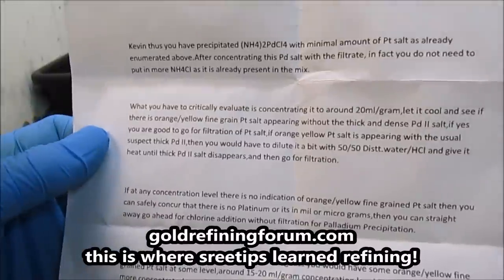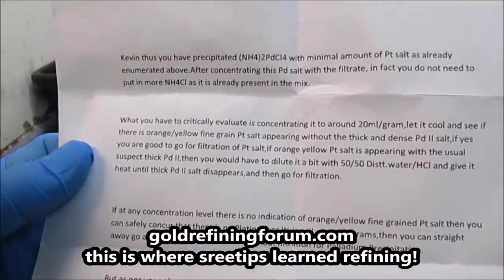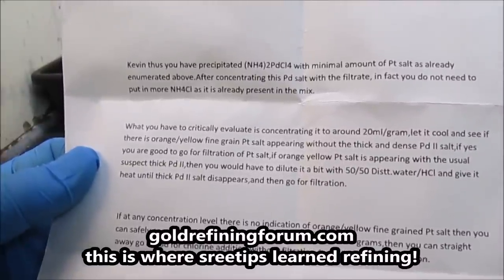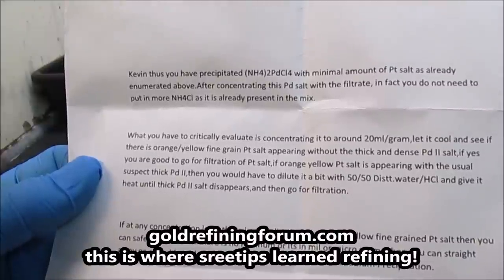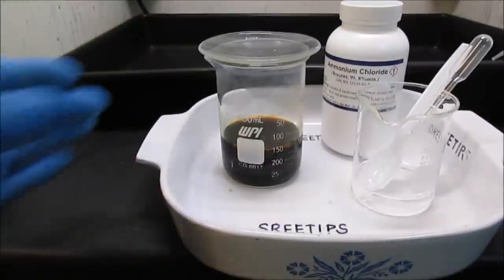Before I show this next segment, I want to go back in time. Three or four years ago I tried this experiment and I over-concentrated the palladium solution to about 5 ml per gram concentration. When I added the ammonium chloride solution I got a thick crystalline-like precipitate called PD-2, which is undesirable in this reaction. These are instructions I downloaded from goldrefiningforum.com. It says you have to critically evaluate concentrating the solution to around 20 ml per gram, let it cool, and see if there's any orange or yellow fine-grained platinum salt appearing without the thick and dense PD-2 salt. I don't see any thick dense PD-2 salt here.